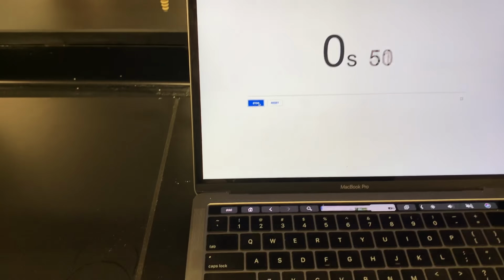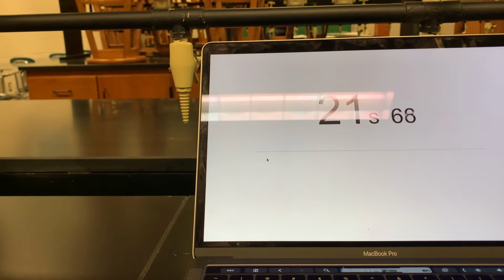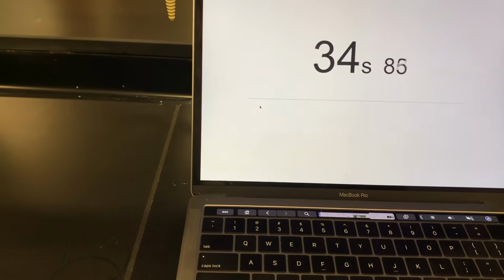So what we're gonna do is I'm gonna start a timer here, and we are going to let that soak for about 10 minutes in there, just so that the whole gel in all of our cubes, our 1 centimeter, our 2 centimeter, and our 3 centimeter, become completely translucent. And when they become translucent, what that tells us is that the sodium hydroxide has soaked through all the way to the middle of the cubes. All right, so we're gonna come back. I'll let this soak for about 10 minutes. I won't make you watch the video for 10 minutes, so we will be back.